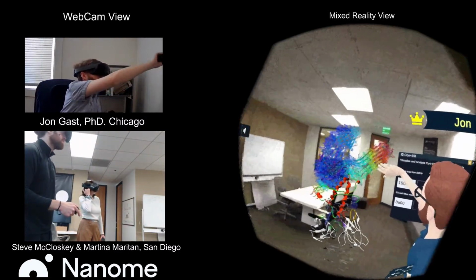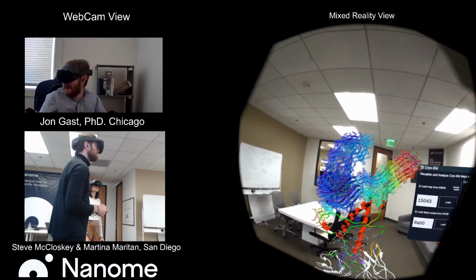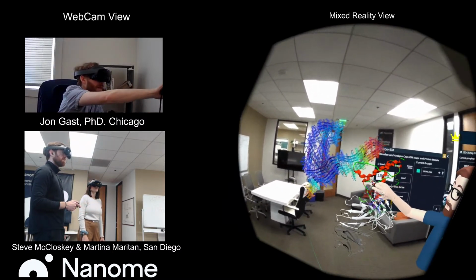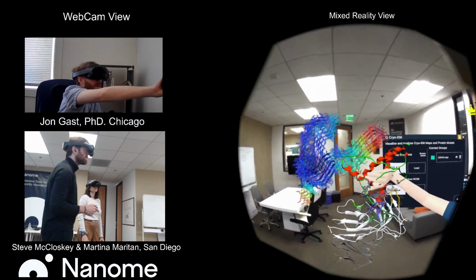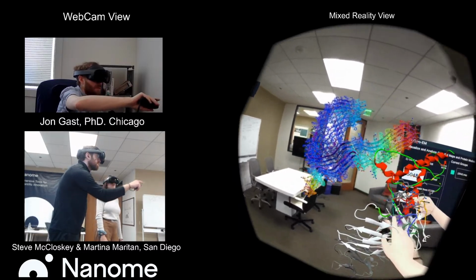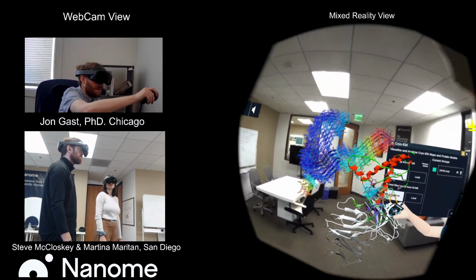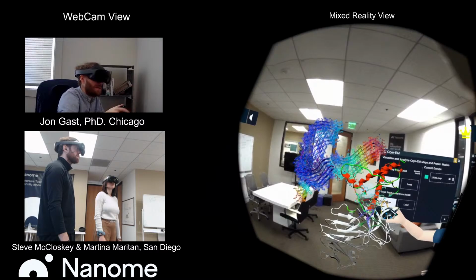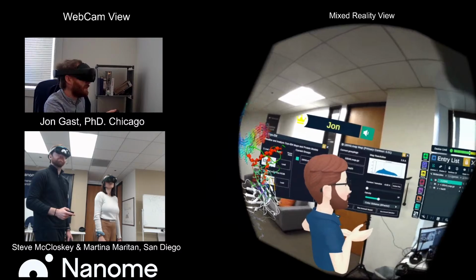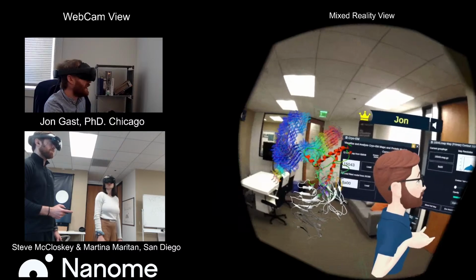And so instead of looking at the whole thing, where it's going to be a little bit harder to see, we'll focus on just one. While we're setting that up, we're going to select, here in gray, which parts of the prion are engaging the CDR loops, the highly specific variable groups that an antibody uses to bind. I'm going to select all the residues that are exposed, and from here do a quick deselection of the antibody, the Fab.